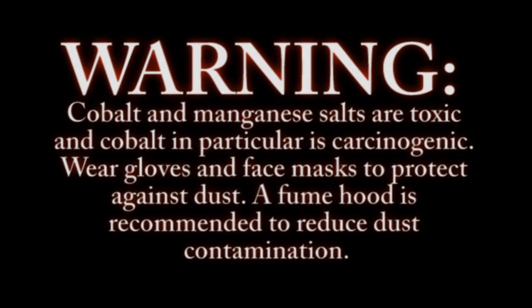Cobalt and manganese salts are toxic, and cobalt in particular is carcinogenic. Wear gloves and face masks to protect against dust. A fume hood is recommended to reduce dust contamination.